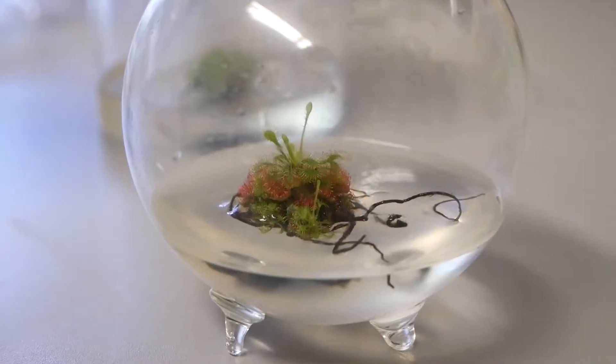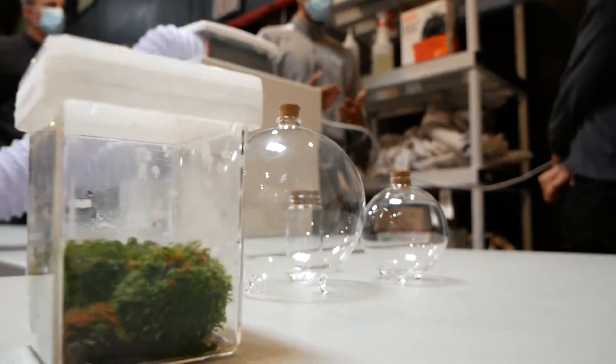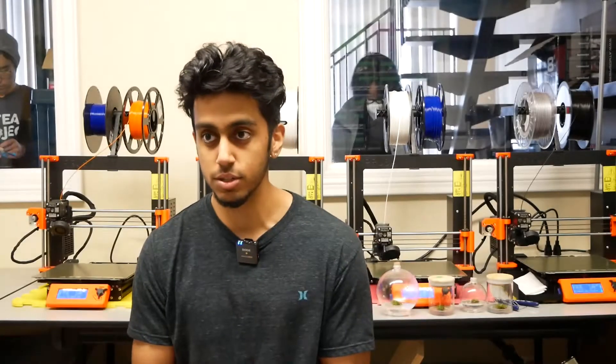Essentially what tissue culture is, is taking a small amount of plant material and putting it in an artificial environment that has the certain micro and macro nutrients it needs to grow, and then encasing it so that it's completely closed off from everything outside.